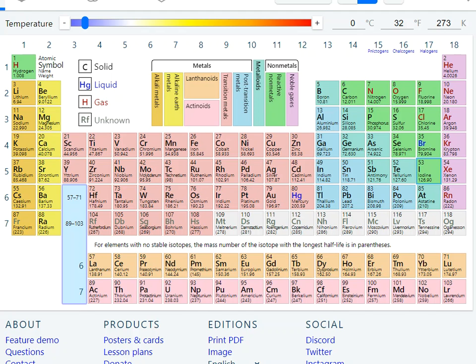That means they stay in solution, except for mercury, number 80, right there, silver, Ag, which is number 47, right there, and lead. Can you find lead? I don't want to do all the work. Can you find lead off this periodic chart?